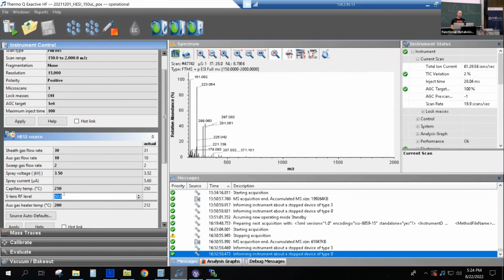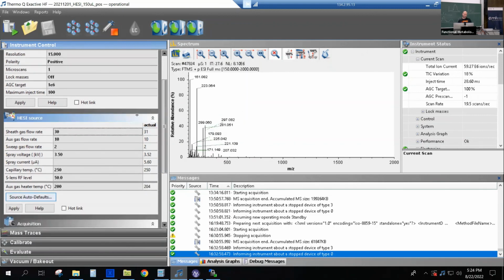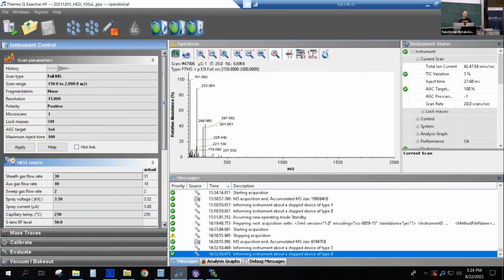So it's really what Stefan said, or what Robin said. It's limited what you can do here. It might look very different on the LTQ Orbitrap. There you could select a lot of different voltages, and for sure it's very different on the Bruker platforms.